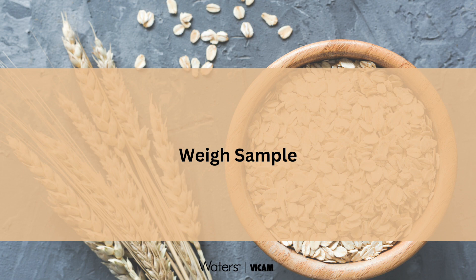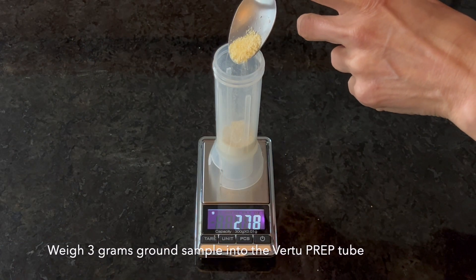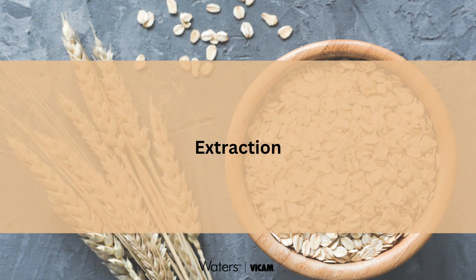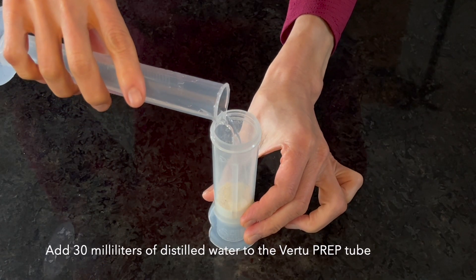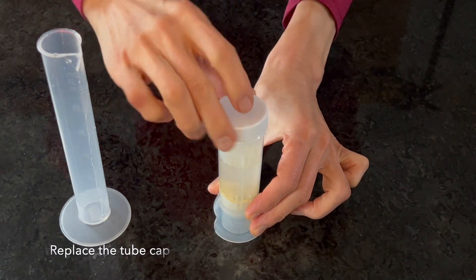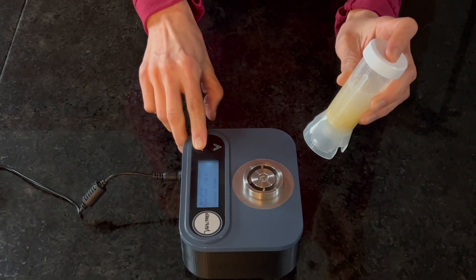To extract glyphosate from a cereal grain sample, weigh 3 grams of ground sample into the VirtuPrep extraction tube. Add 30 milliliters of distilled water to the sample in the tube. Replace the tube cap, then invert the tube and shake briefly to wet the sample.